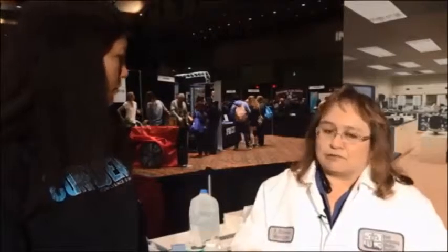Thank you. Do you want to tell me a little bit about the lab and what the exhibits? Just start wherever you're comfortable. Sure. Our laboratory serves SAWS both on the water side and the wastewater side. Some of the booths that we have are representations of all the different areas that we test different samples for. So for instance, we have a booth over here where we look at micro samples and plating samples from different media that we've grown, and we look at different microorganisms to test the water and see how well it does.